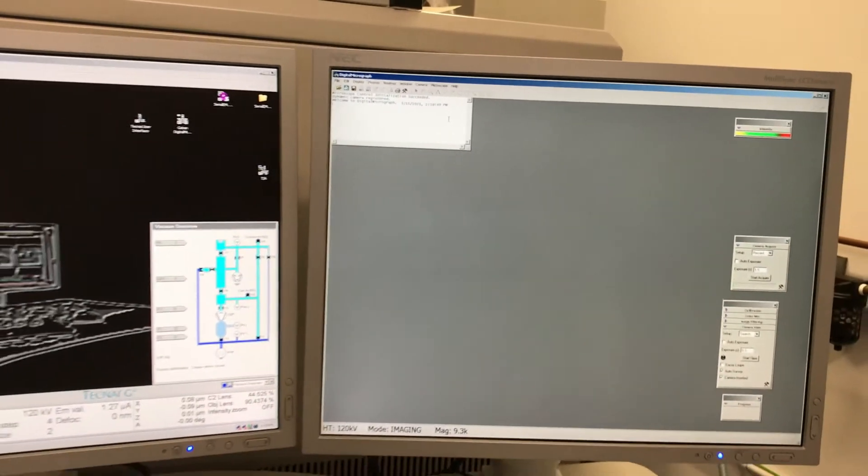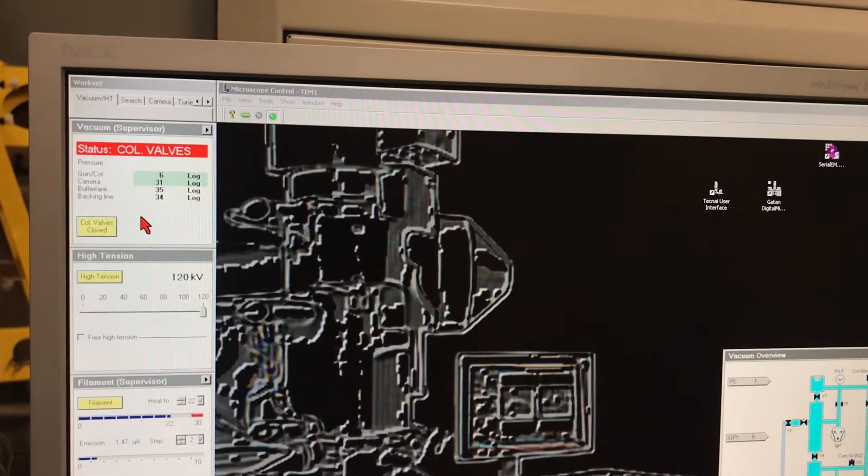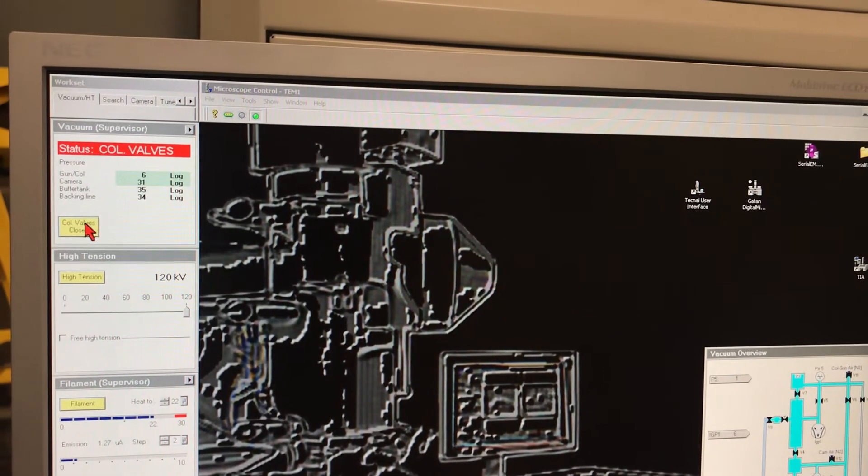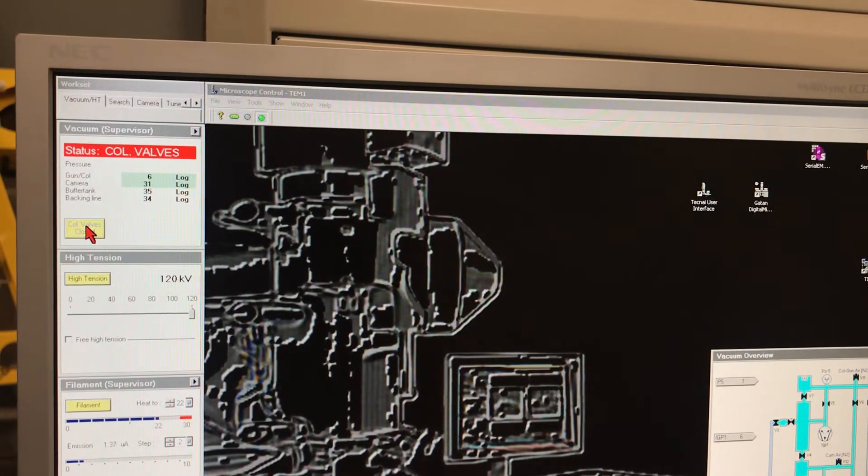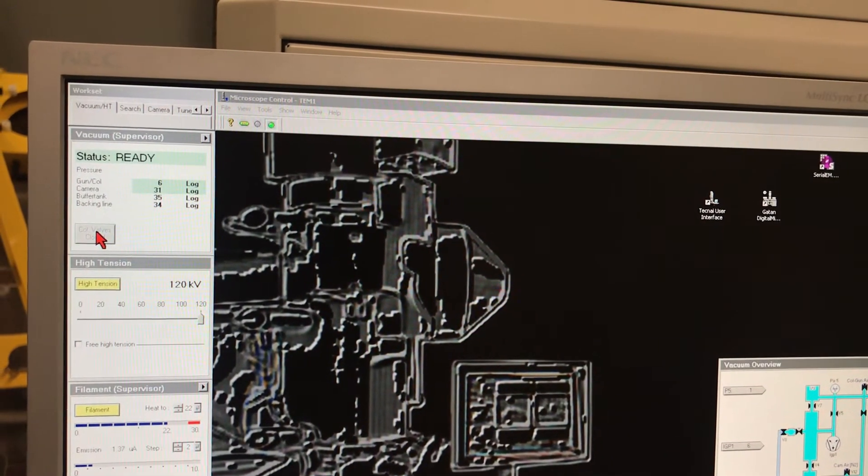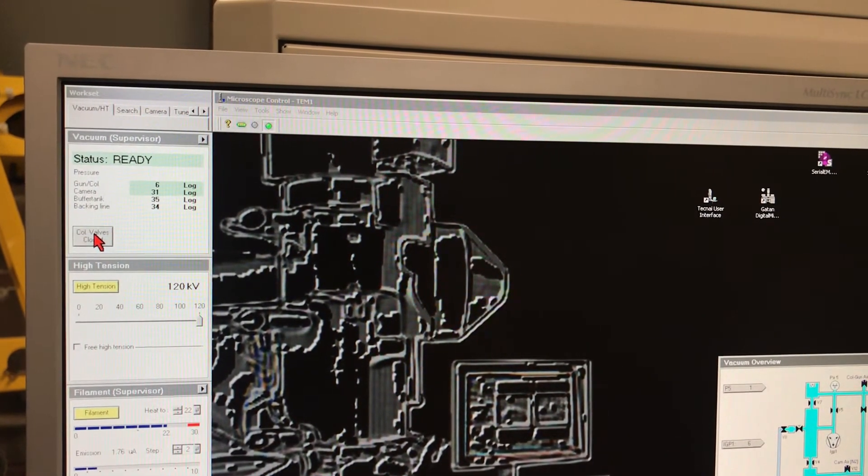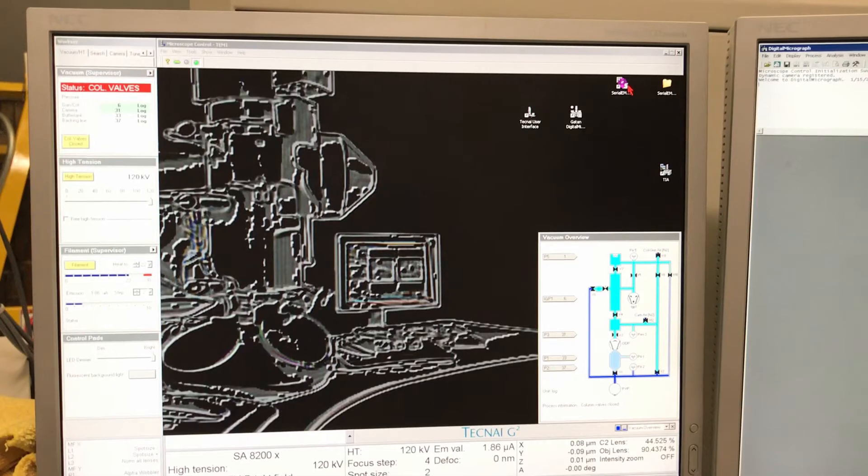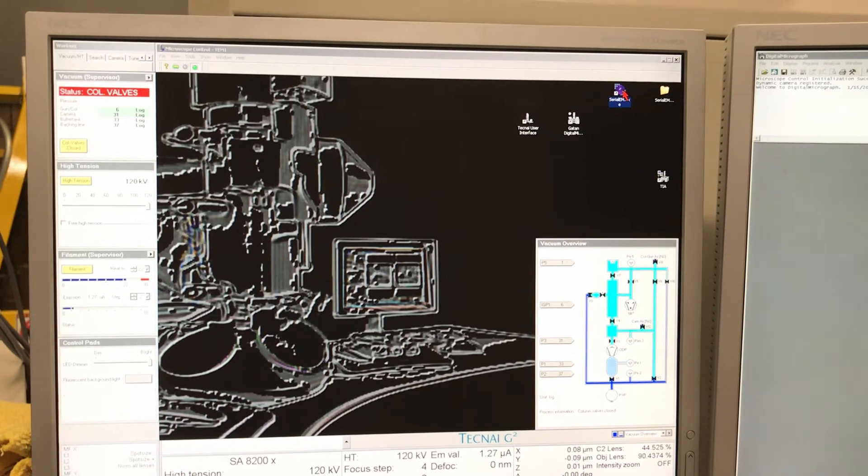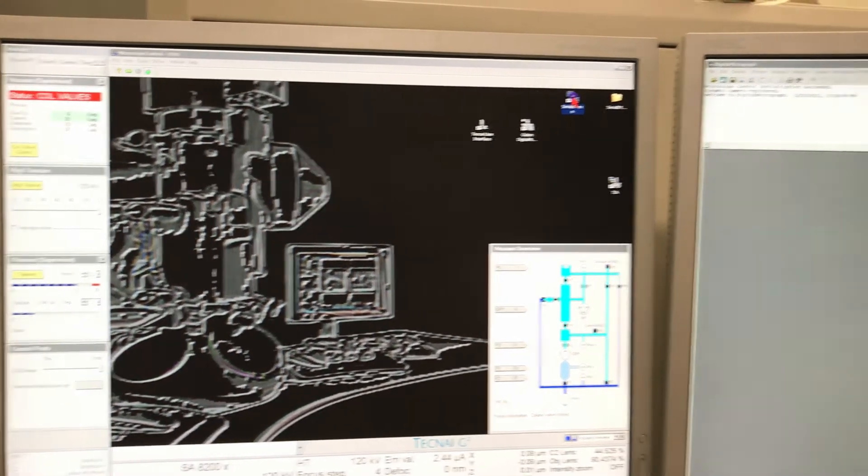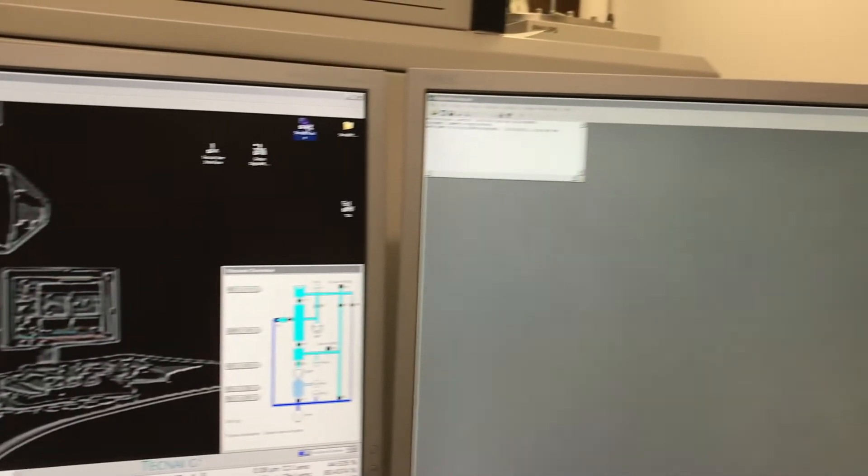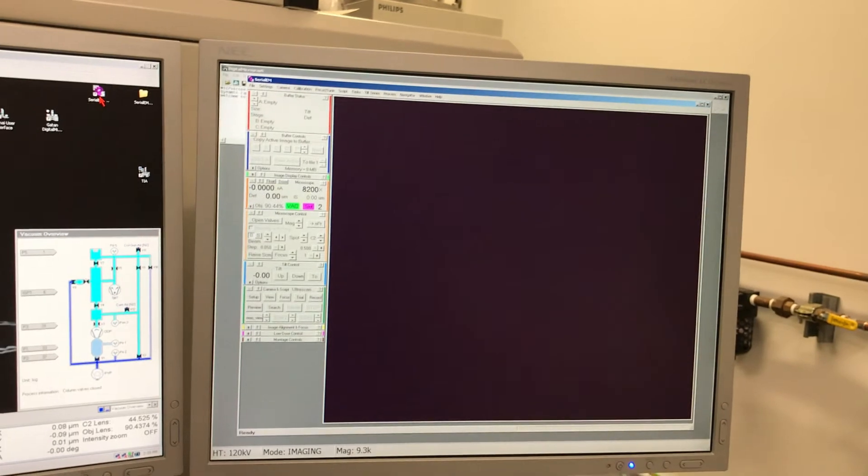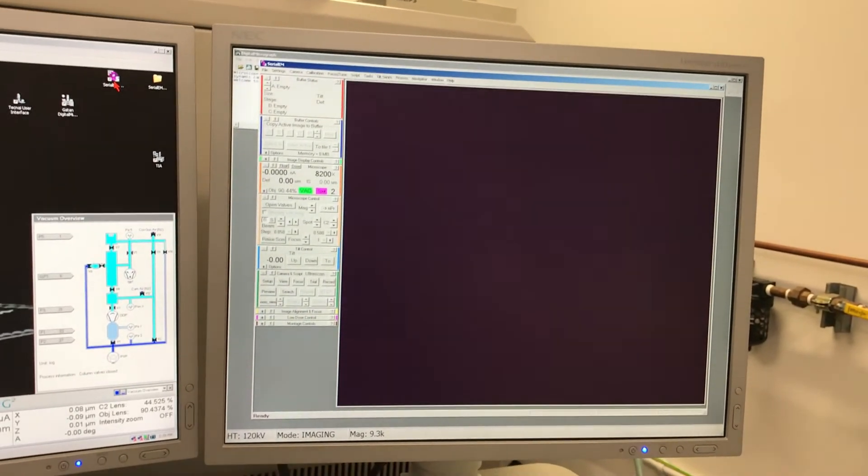Now we need to open the column valves of the microscope and take a look to see if we can see the electron beam. Since we see the fluorescent green color on the visualization screen there, we are now ready to look at the grid, for which we will be using the program called SerialEM.